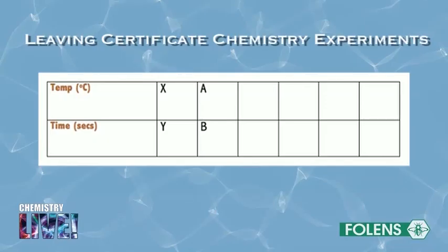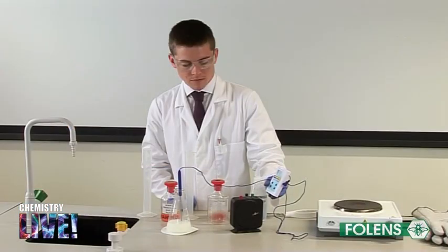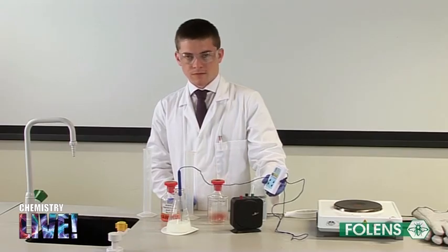Repeat the experiment for temperatures of around 40 degrees Celsius, 50 degrees Celsius, 60 degrees Celsius and 70 degrees Celsius. Enter your own data into the table.